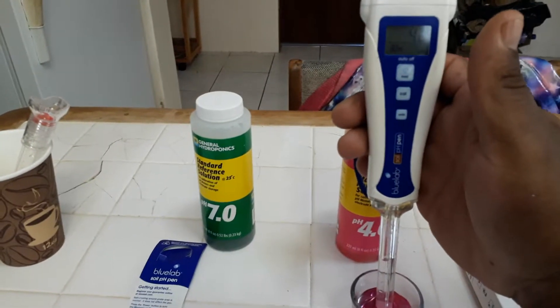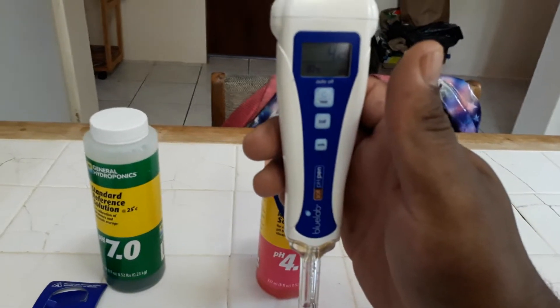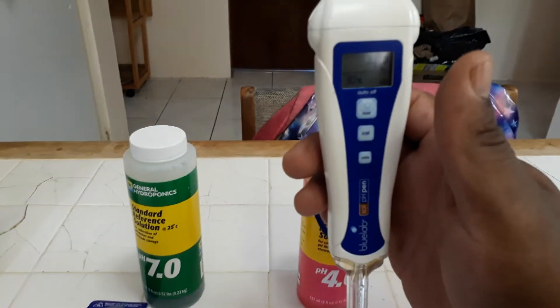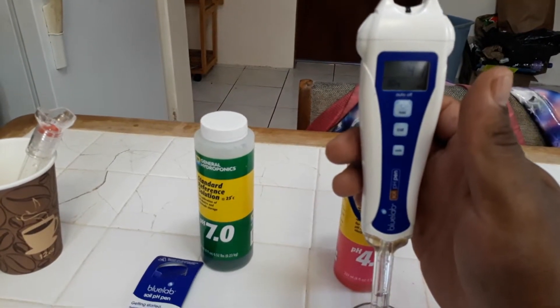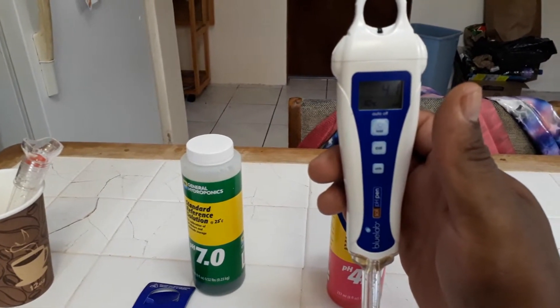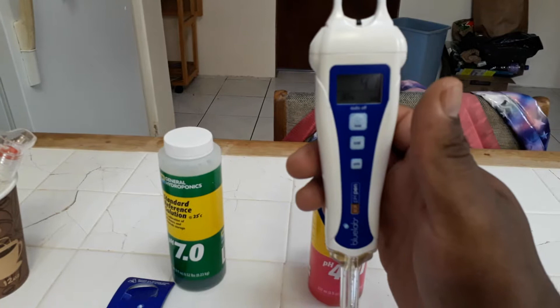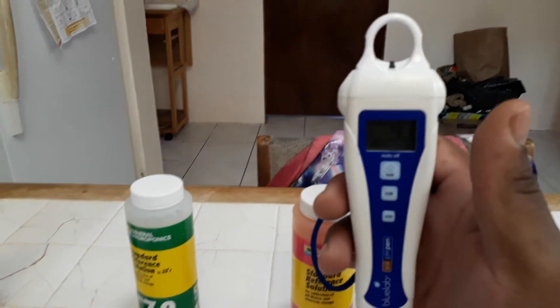It seems to have stopped around 4.2. It takes a while to pick up the pH, so just wait and make sure it's completely settled on a number before you take the reading — you don't want inaccurate readings. It looks like it has stopped at 4.1, which is pretty good since the solution is 4.0. It's supposed to be 4.0 but 4.1 is very accurate — I'm liking this Blue Labs meter.